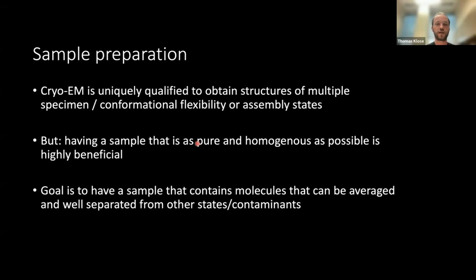However, even though we can computationally sort into different structures or different specimens, it is still advantageous to have a sample that is as pure, as homogeneous as possible to avoid downstream problems in processing and data collection. So our overall goal for sample purification would be to have a sample that only contains molecules that can be averaged together, so they're the same specimen, and or can be well separated from other specimens and contaminants.